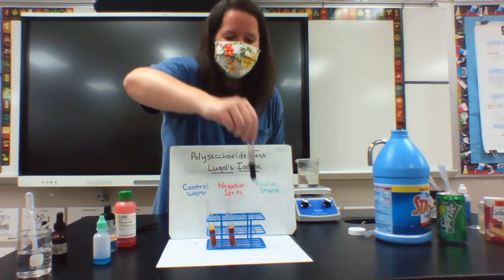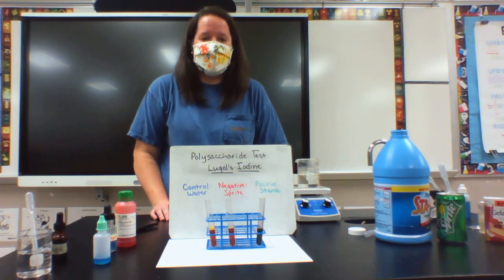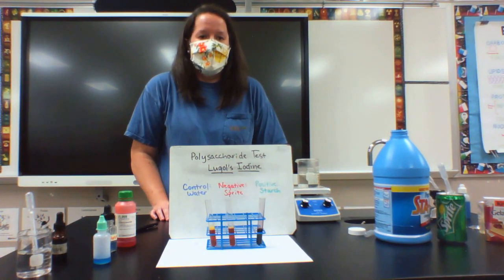So there you go. Hopefully this helped you to see the results of the indicator test and understand a little bit better about how we can know which biomolecules are in which solutions.